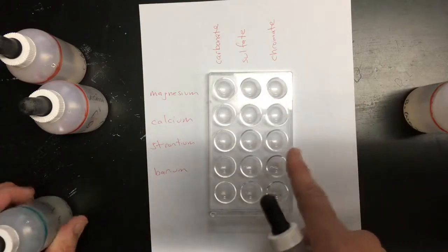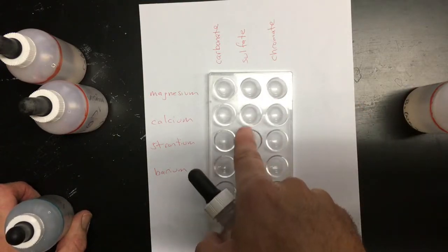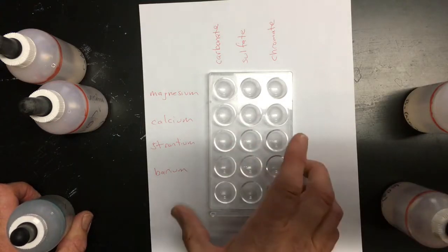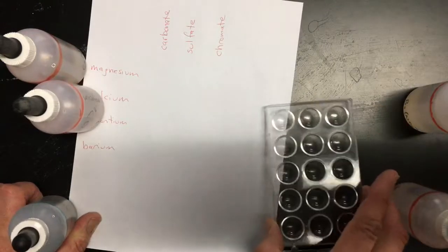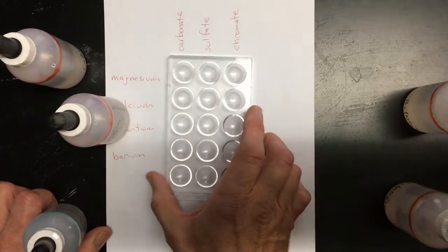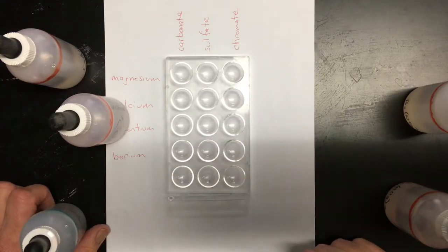And as you go around, you get to where you're going to be adding drops, mixing drops, you will see reactions and look for what goes on inside the spot tray. If it helps, you can hold it against a black surface or hold it up to the light to see what happens. You're going to see different reactions in each one. And the idea then is to see how they rate compared to other chemicals. Have fun.